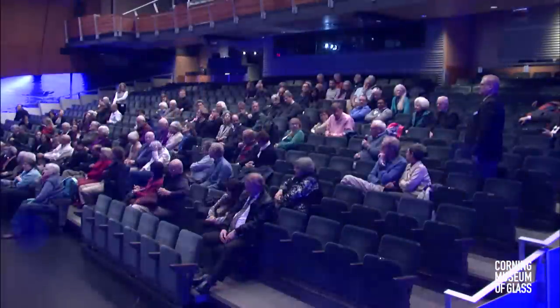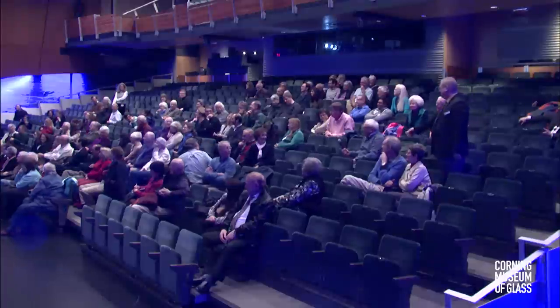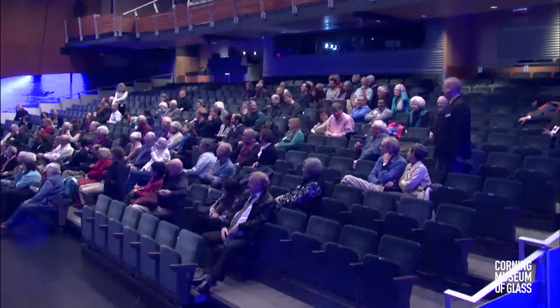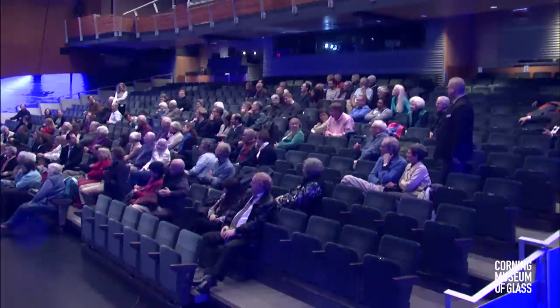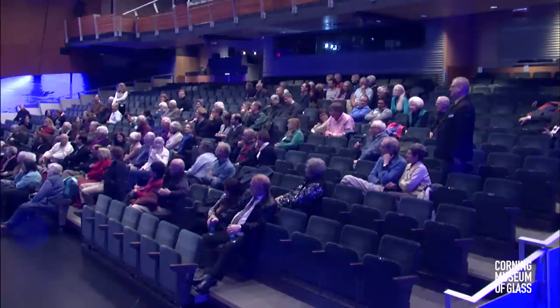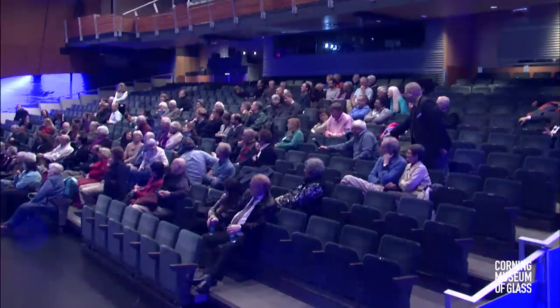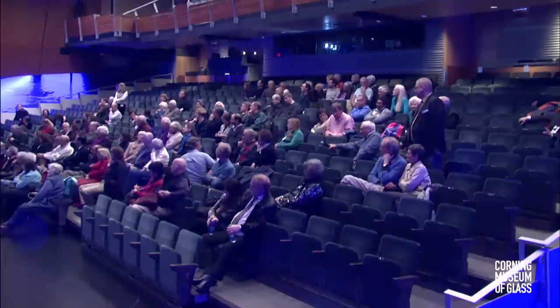Why did you choose a borosilicate glass composition for your lenses? Because we just love glass so much. Why not go with window glass, a soda lime, which is much cheaper, or maybe a high index glass like a lead glass? I think Jim did most of the early lens testing, and we've gone with the borosilicate since then. So I am not the most informed person to answer on that. But that's one valuable thing I can take from my visit here today, an actual knowledge of glass.